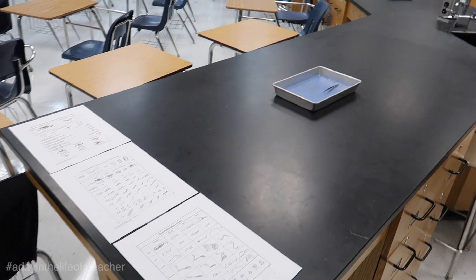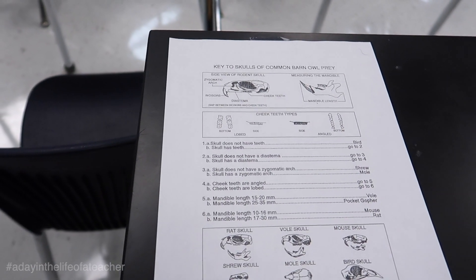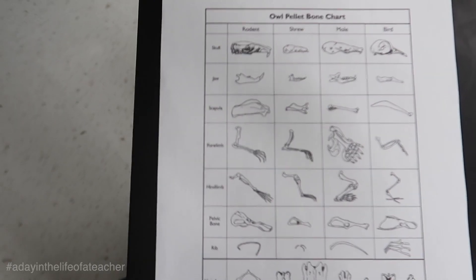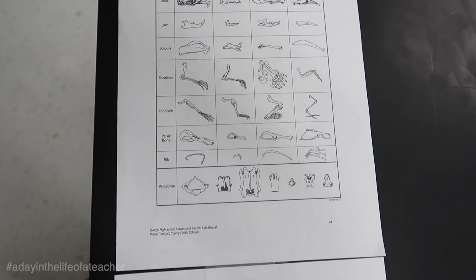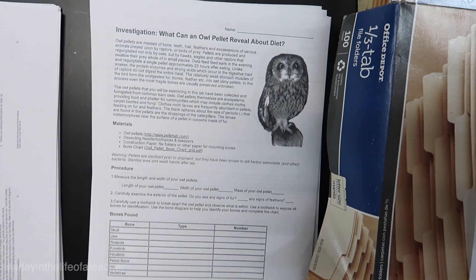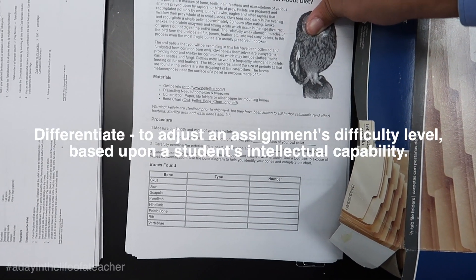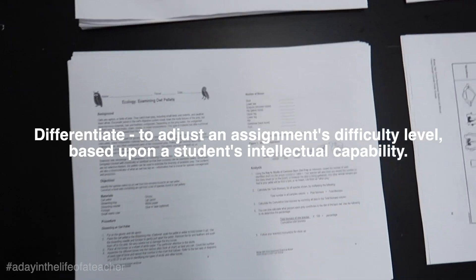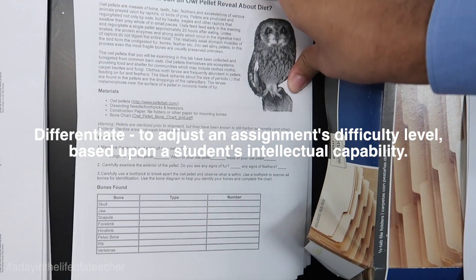At every single table I have a dissection kit as well as an anatomy chart for the owl pellet. This anatomy chart is going to help the students identify what their owl ate. We also need to differentiate this lab because I have some really high-level students. So this is my high-level student lab, and this is my general biology owl pellet lab. The only difference between the two is this one has a lot of math involved, to challenge the higher-level students.